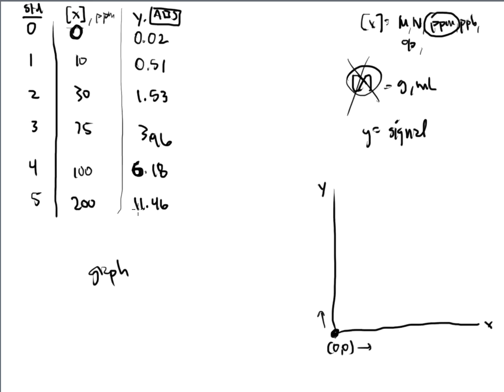And again, those absorbances don't mean anything to me. If I was just given the absorbance and that was it, I have no clue how that absorbance relates to anything. The machine doesn't know either. The machine is stupid. It doesn't know what you want to do. It doesn't know what kind of sample you have made, or what type of sample you've presented it. The only thing it does is do one job, and that's to analyze how the sample is behaving in whatever kind of setup it's given. So it just gives you numbers. That's all that it does. It's not going to do anything else for you.